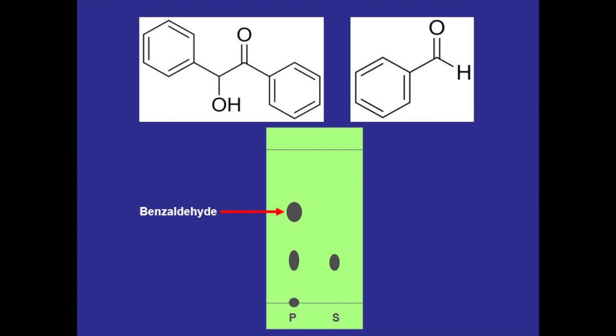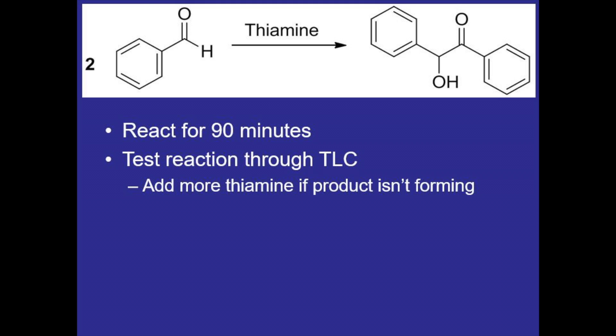If the TLC plate does end up looking like this where there is more benzaldehyde reagent than benzoin product forming then we can simply add some more thiamine and let the reaction continue.